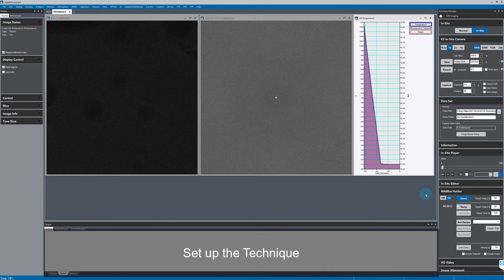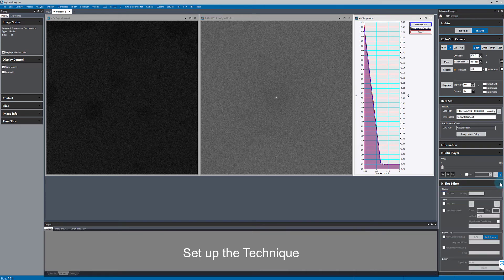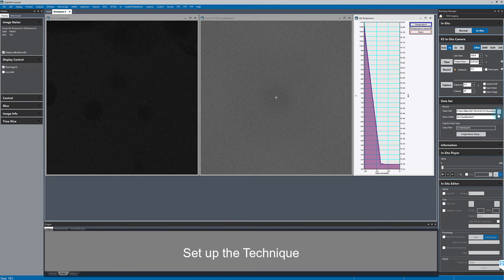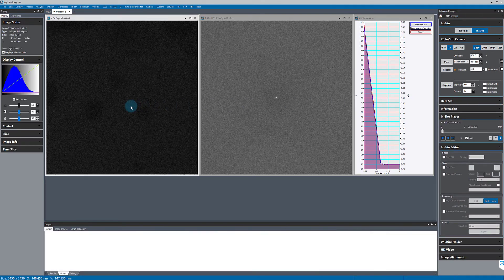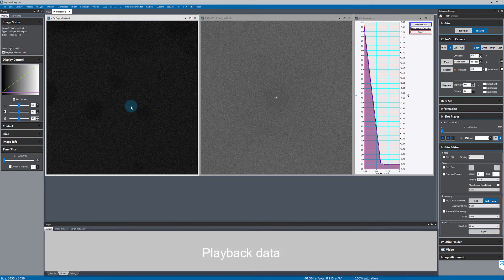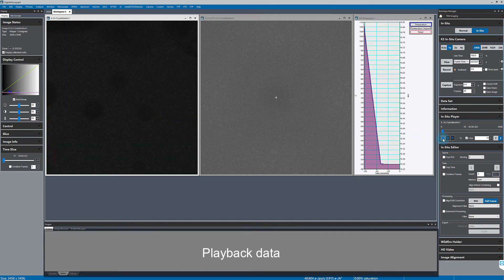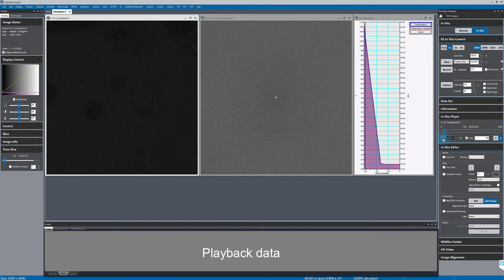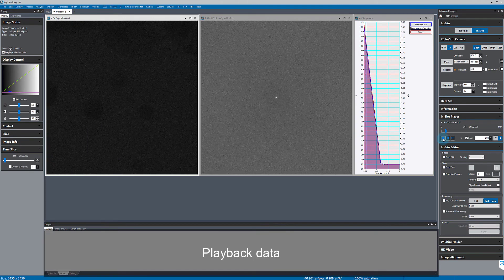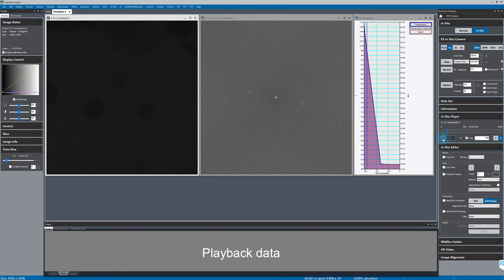Now, I'll collapse and expand different palettes so that I have the in-situ player and editor visible in my technique pane. And I can play back my data set now at real speed, or I can speed it up a bit if I want to.